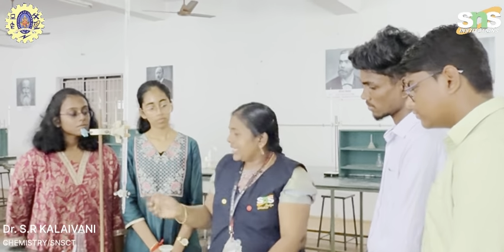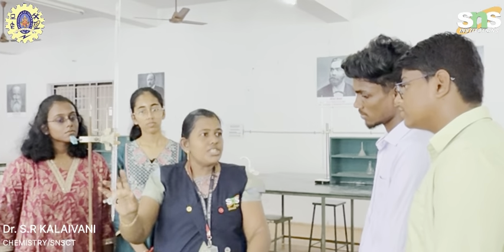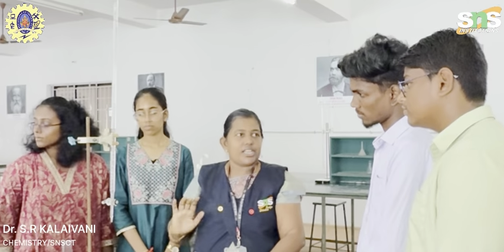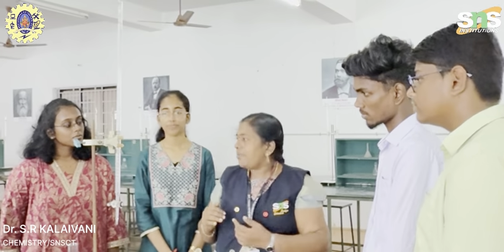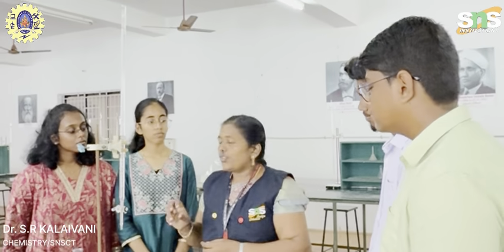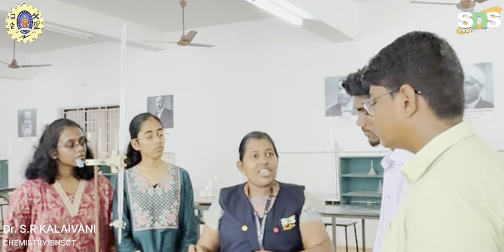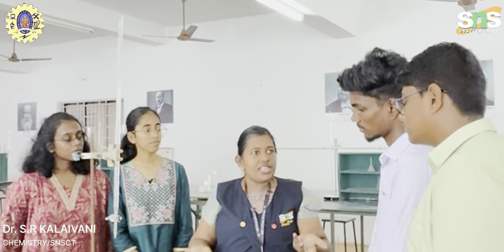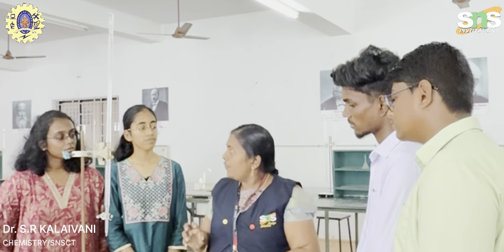Listen, in the second titration, the burette solution is the same EDTA, and the pipette solution is ordinary tap water, our sample water. Our aim is to find out the amount of total hardness present in our water sample, tap water or water for our domestic purposes.